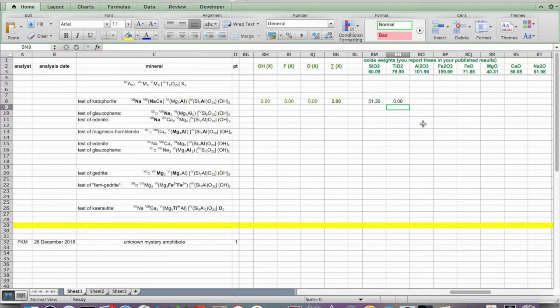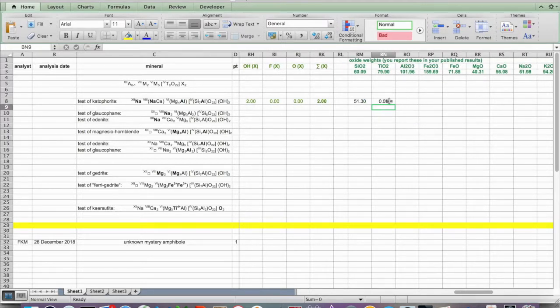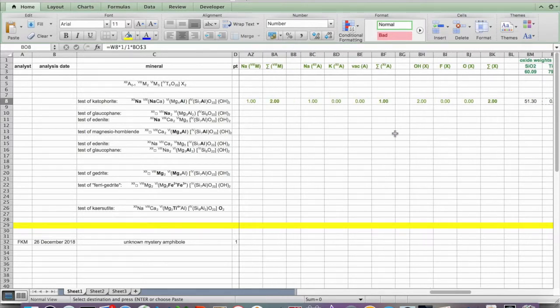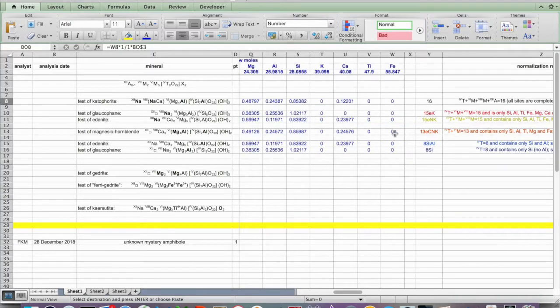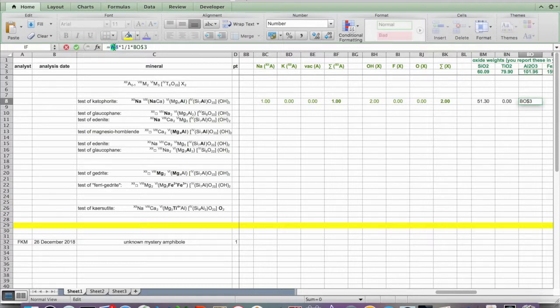So now I'm going to do Al2O3, so I'm going to copy this again over here. And we have to make some corrections. So the first correction is going to be, well, let's make sure we have the aluminum column. So the aluminum column is not W, but in fact the aluminum column is R. So I'm going to change this to an R. Okay, so that's the first thing.